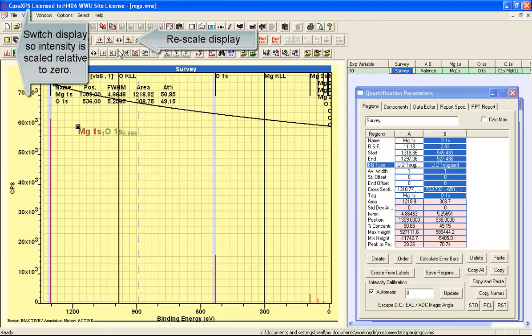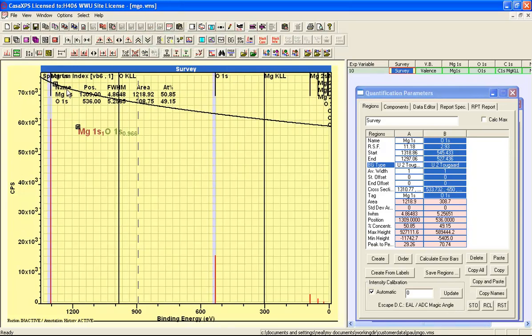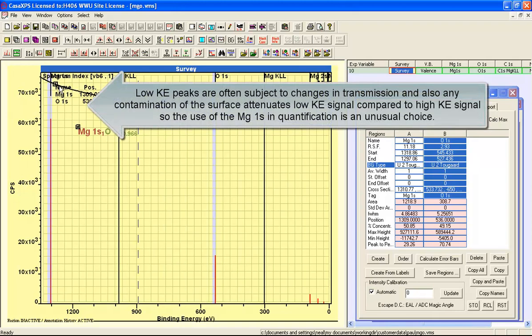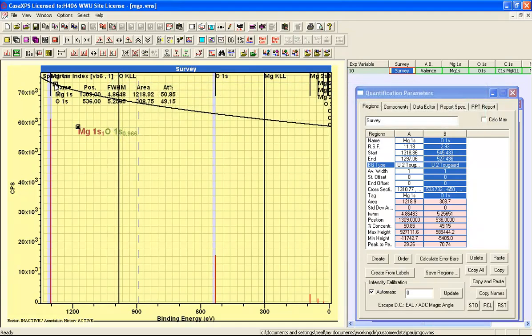So relative to 0, you can see that you have a transmission function that does vary. And one of the things to note is that the rate of change of the transmission increases at these lower kinetic energies. As a rule, peaks in the lower kinetic energy range are the most uncertain in terms of peak area and how they relate to other parts of the spectrum.